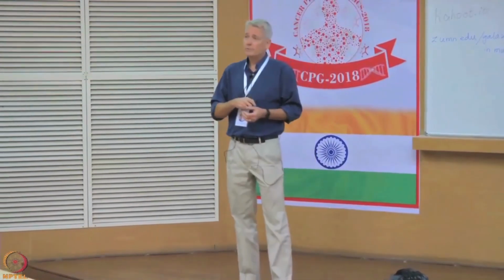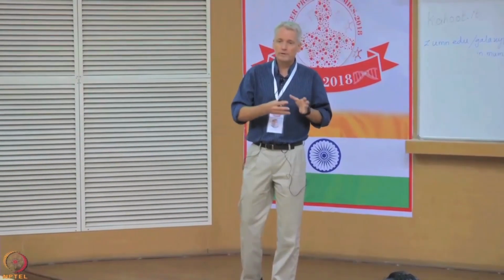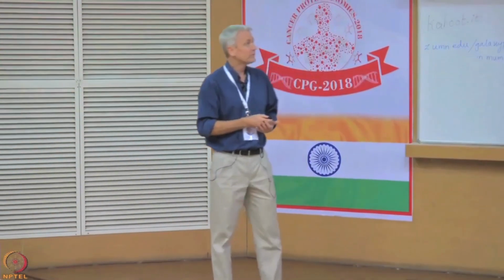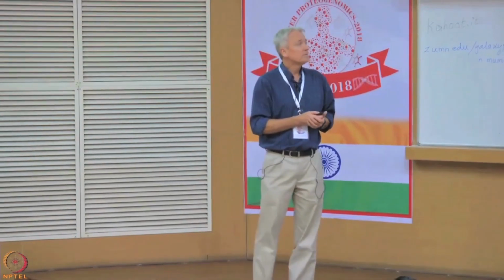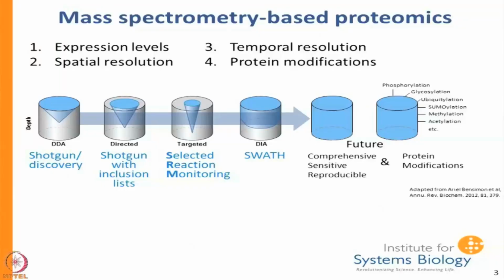Then I'm going to talk about the specific tool and a little bit about what it might be in an ion library that we would want to make sure is proper so that we can be confident in our SWATH analysis. And finally, I'm going to give you a short example of a SWATH analysis to try to illustrate some of the points that I've discussed. And along the way, I'm going to take a detour that occurred to me during Dr. Mani's talk yesterday.